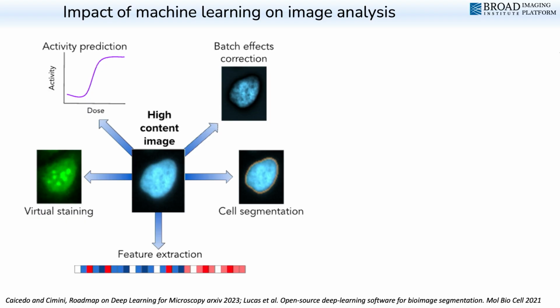I believe last year's talk had folks from the cheminformatics side, where they talked about how you can use chemical structure alone as a source of information to drive the drug discovery process. I'll be talking about imaging specifically.